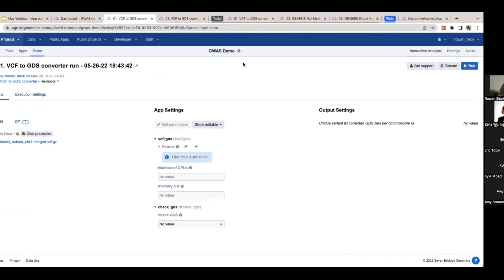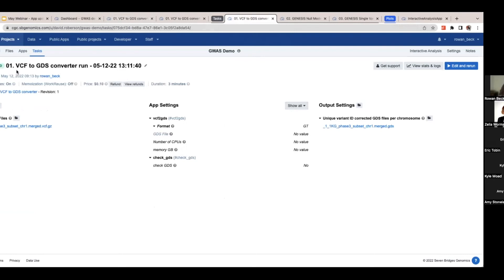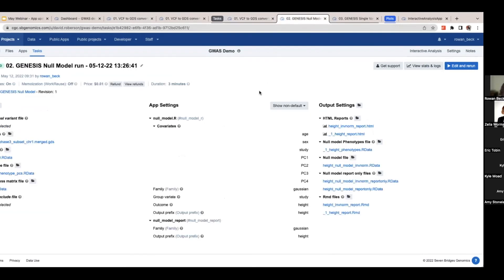I've already pre-run these so we could look at the results together. For this very first step, the VCF to GDS conversion, we start with a VCF file and in the output settings you'll see a merged .GDS file, so you'll know it worked. For the second step, fitting a null model, this is a little bit more complicated because there are more files to add.